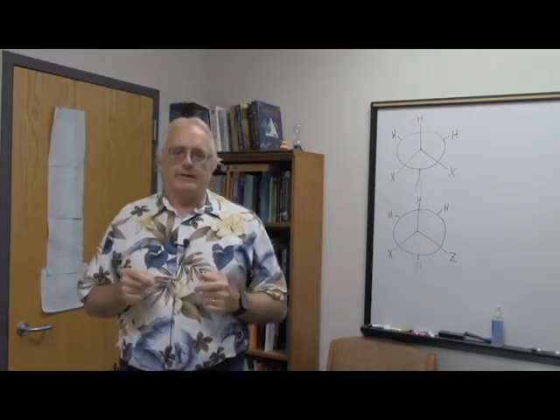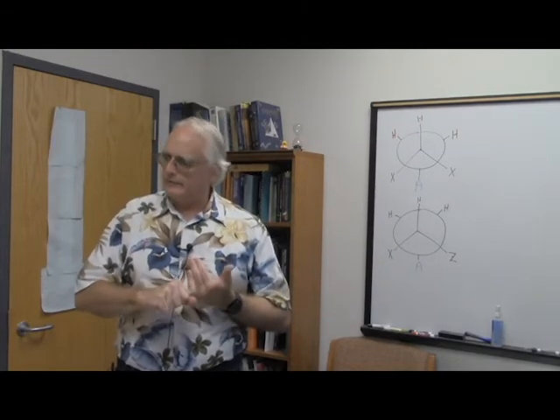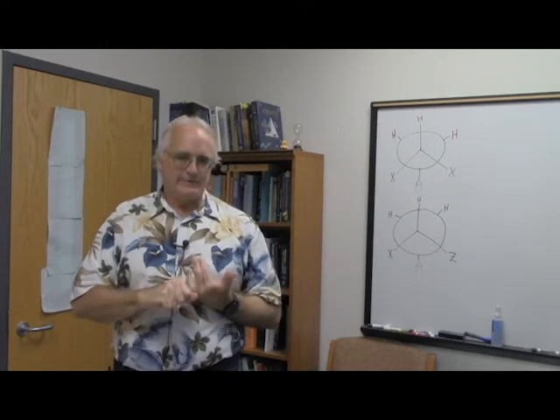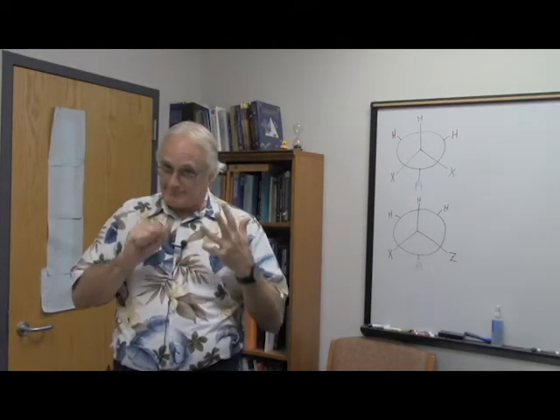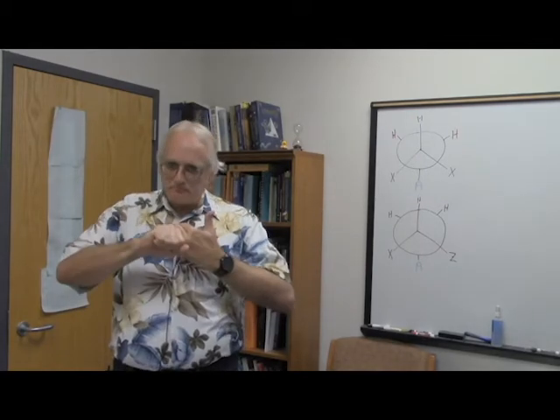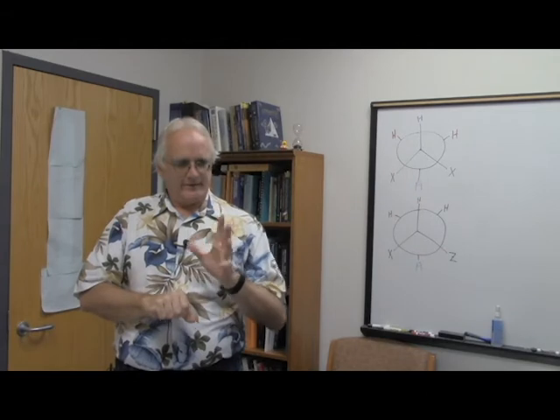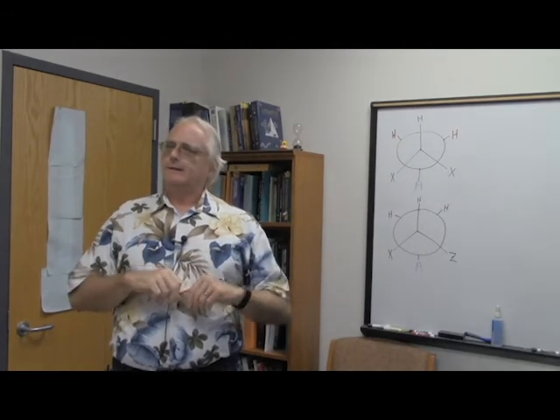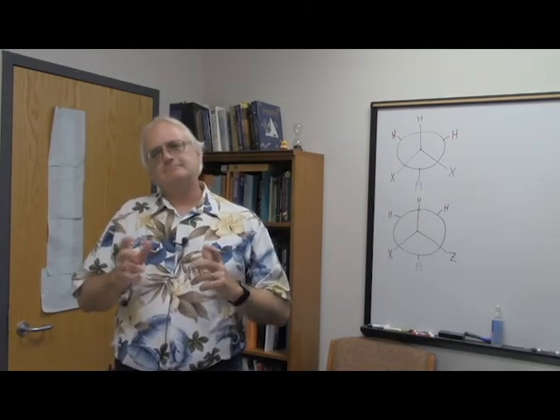So there you go, methylene groups. Another way they can be quite problematic when you're trying to interpret a proton spectrum. The second order effects, the fact that even though they are on the same carbon, if there's never a mirror plane between them, they can never have the same chemical shift. They can have a close chemical shift, but not exactly the same. And despite all that free rotation going on, CH2 groups near chiral centers are another source of trouble for that simple, seemingly CH2 group. Darn methylenes, but we can handle it.